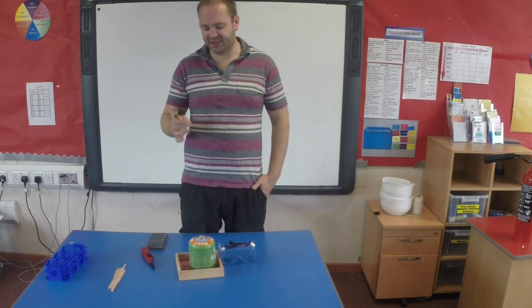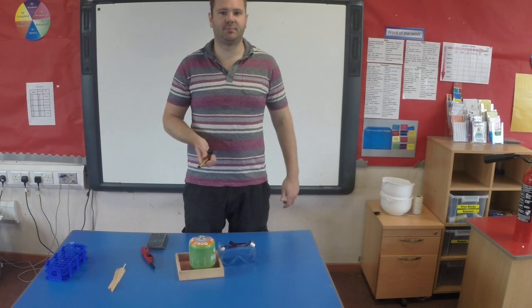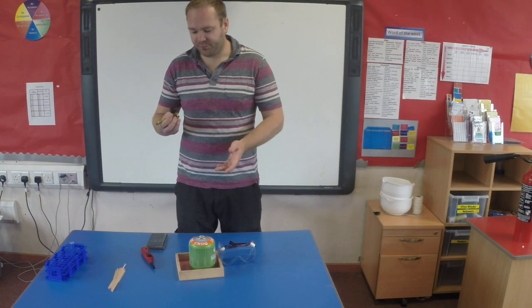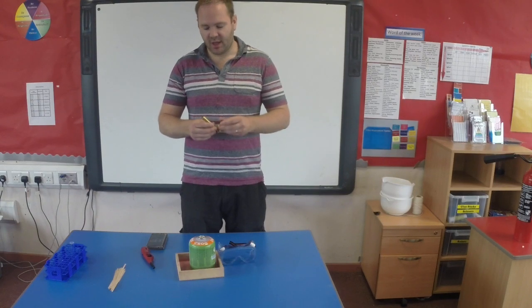Hi guys, in this video we're going to be looking at how to safely light a portable gas burner for primary school science. Now obviously in primary school science we don't usually have the luxury of a mains gas supply, which the high school would normally be able to use for lighting Bunsen burners. So we have to make do with a portable compromise.